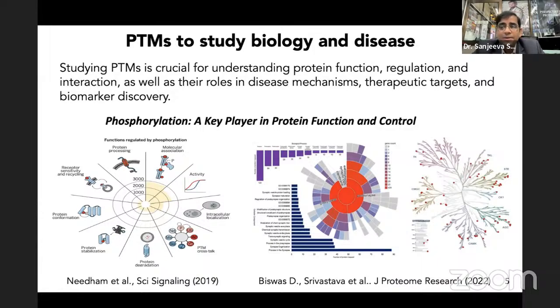Of course, in your theoretical course of proteomics and proteogenomics, we did not have time to touch upon all the latest advancements, but these are some of the quicker updates. And as I said, it was not possible without the very latest high resolution mass specs, like the Orbitrap, Astral Orbitrap, and the timsTOF mass spec. Without them, it was not possible to go to that level of depth for these very important classes of proteins, membrane proteins and the PTMs, or even looking at the single cell proteome.